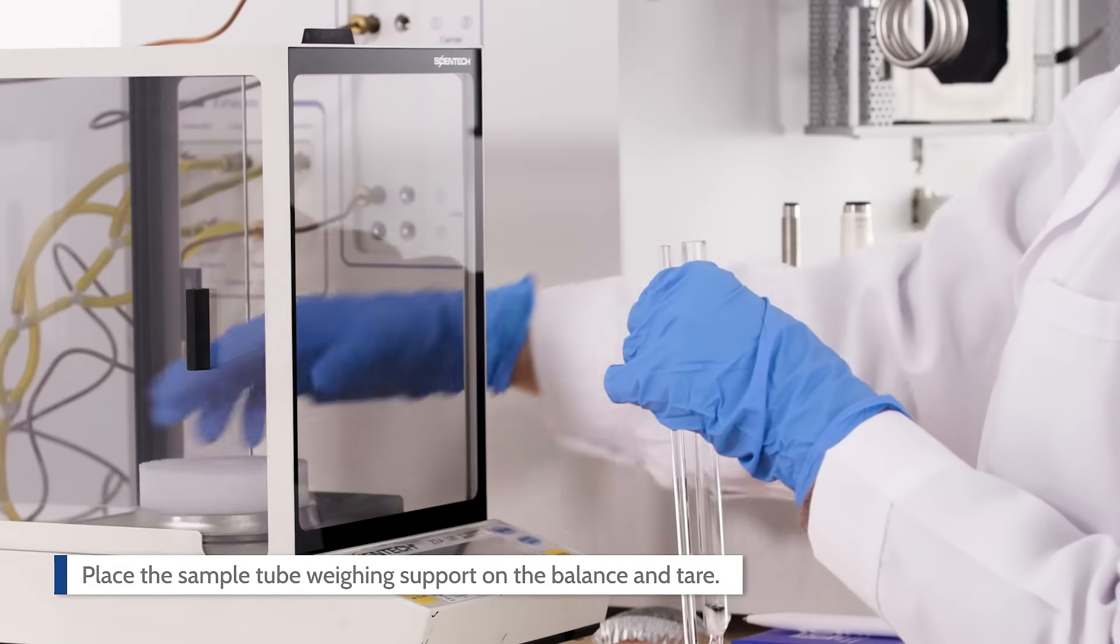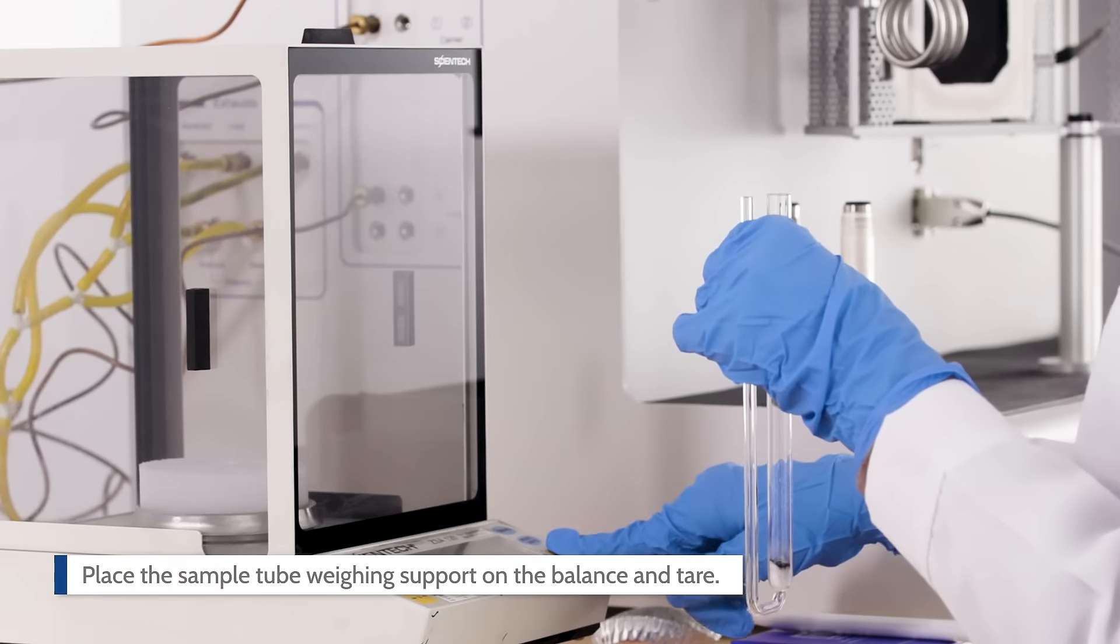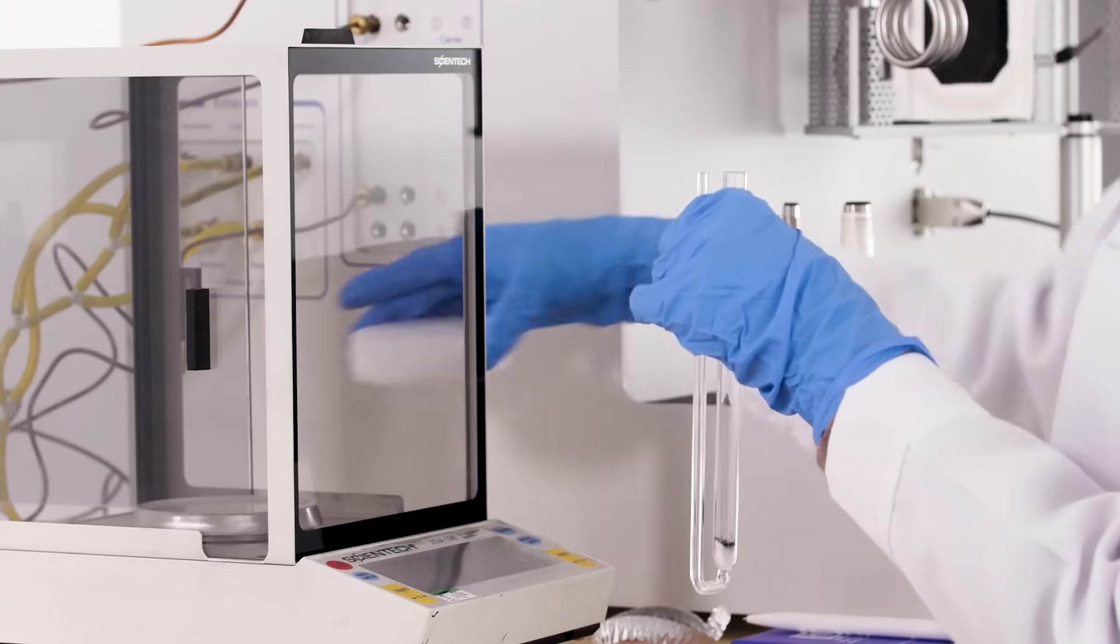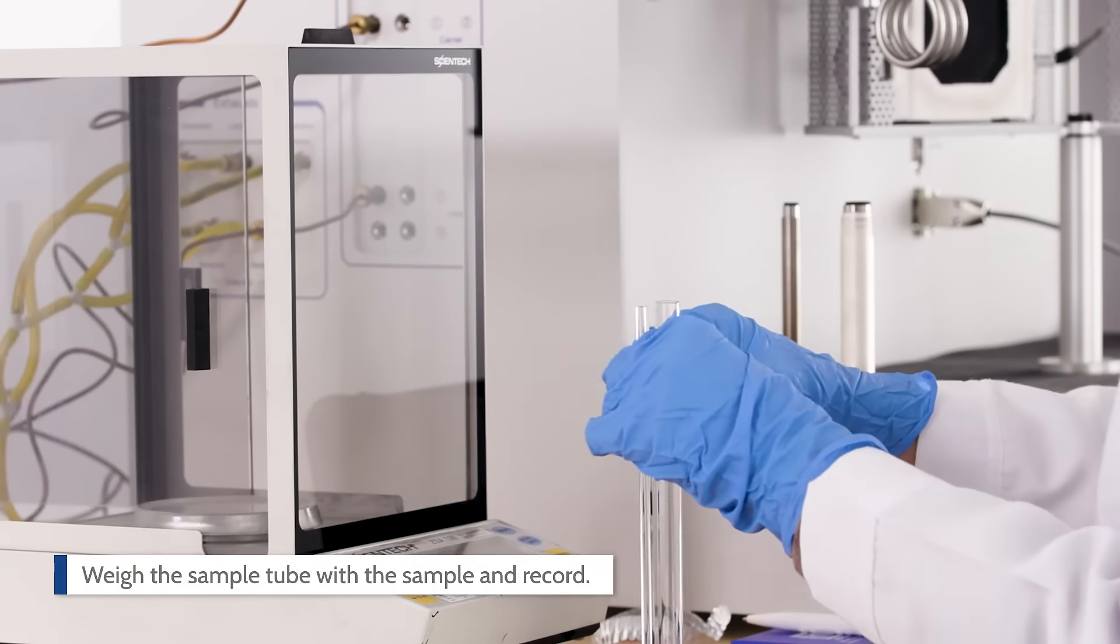Place the sample tube weighing support on the balance and tare. Weigh the sample tube with the sample and record. Now the sample tube is ready to be attached to the instrument.